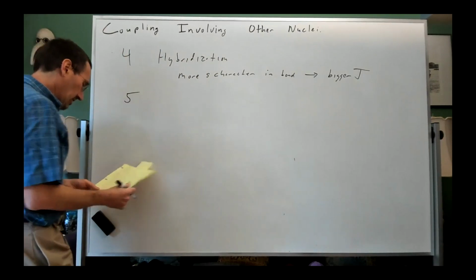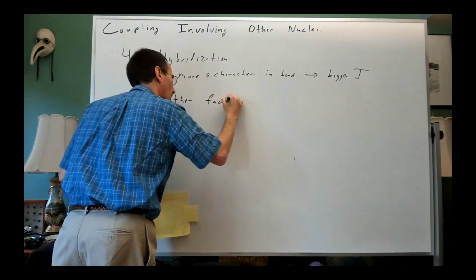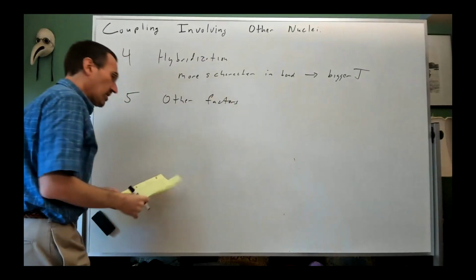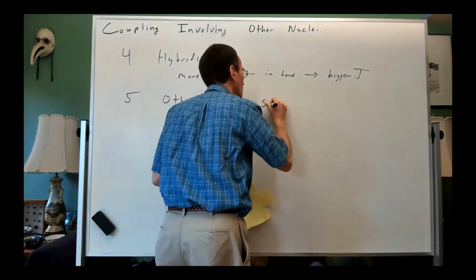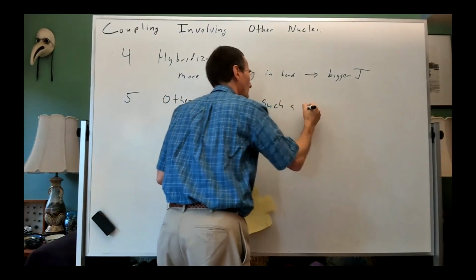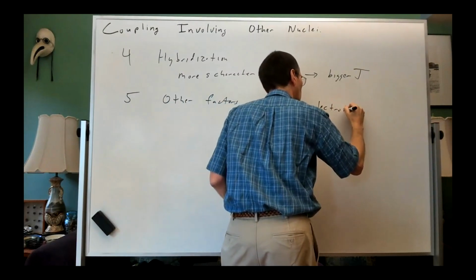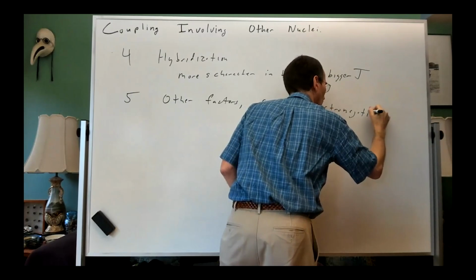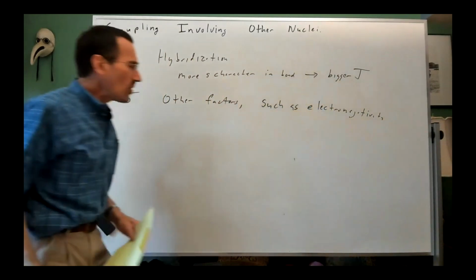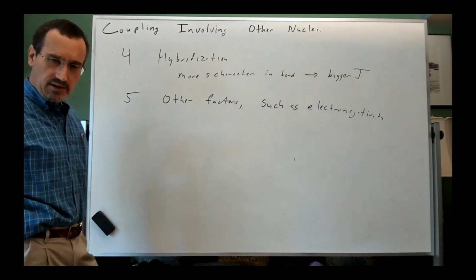Other factors, and I'll just sort of lump things together, such as electronegativity. We've already seen a little hint of this in some of the spectra we've looked at.